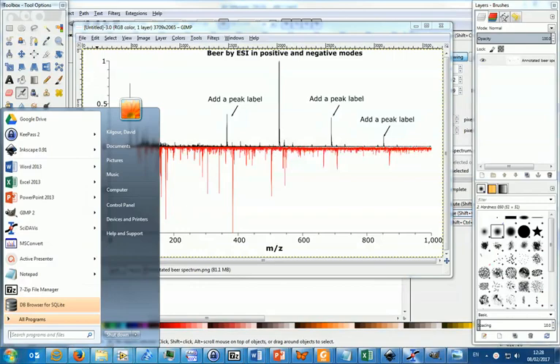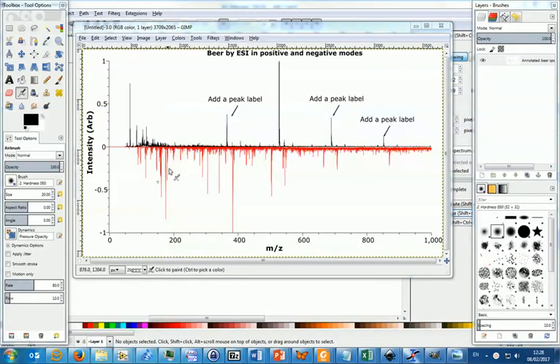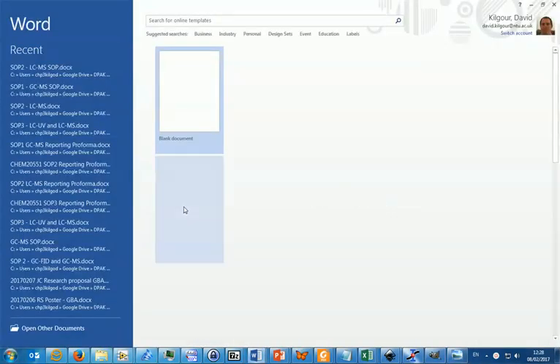I tend to save TIFF images with LZW compression because it makes the files a little smaller. So that is the TIFF image saved, and now you can embed it in Word documents or reports as you need, including submission to journals.